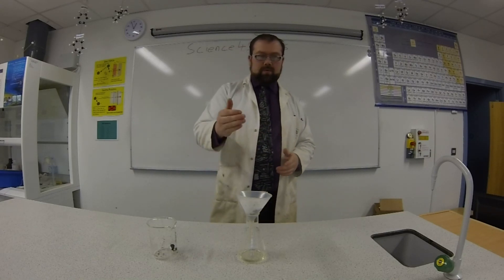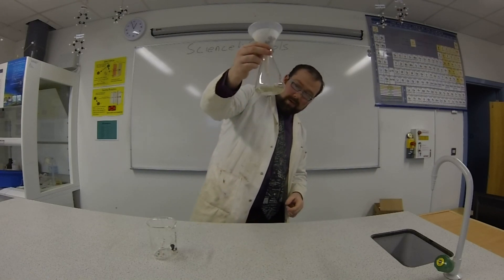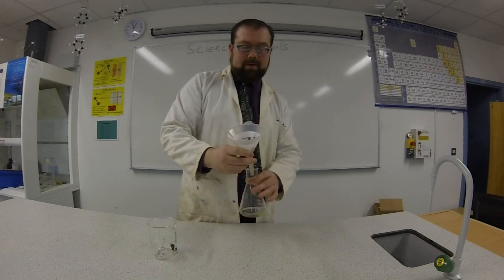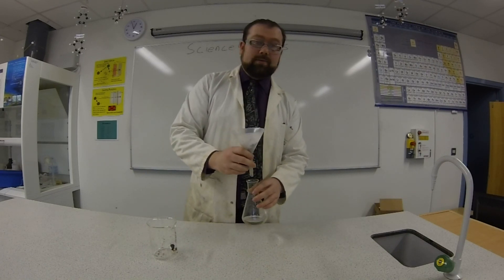It's taken a little while, but the water has all gone through the filter paper. You can see, if we look at the bottom here, that's nice clear water right there. And if we look at the filter paper, you can see there is all of our plant matter, all our dirt, and the seed will be in there as well.